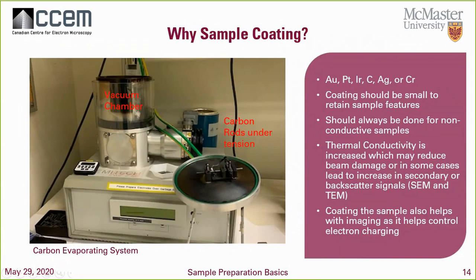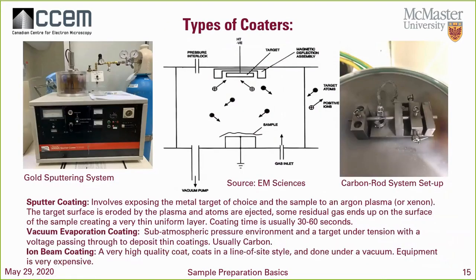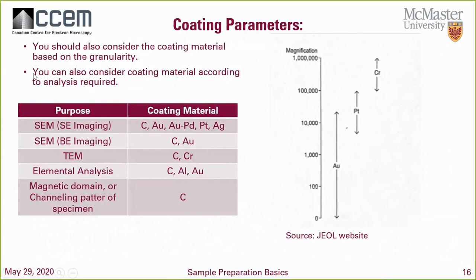But I would say anything from maybe 5 microns to 10 microns coating for each. If you wanted to do SEM work, 10 microns of carbon or gold would be good. If you're doing backscatter, again, very light, 7 to 5 microns of carbon would be good. Then for TEM, we're talking about nothing more than 5 nanometers. Oh, sorry, everything in nanometers. Apologize. About 5 nanometers.